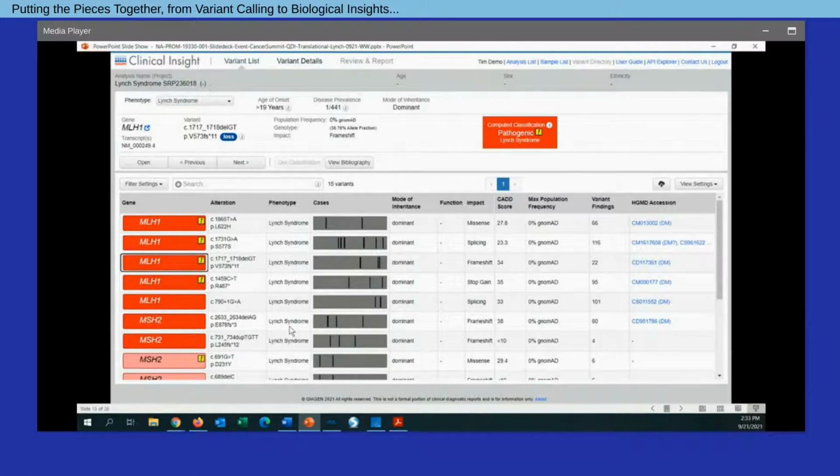So really this table that we're looking at in this slide is very similar to what we've seen already in the software. The key difference here is that under this cases column, we do flag up how many samples have a particular variant of interest. And here we can see across the cohort of 84 samples, not only do we see variants in MLH1 in particular that are recurrent, but also MSH2, again, 2 genes notably associated with mismatch repair.